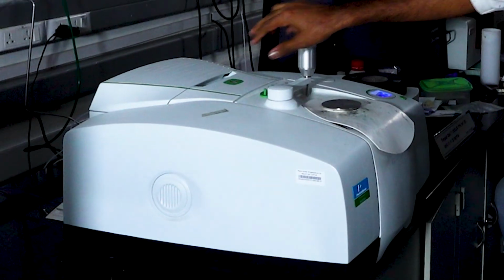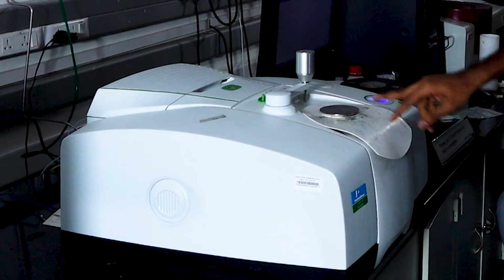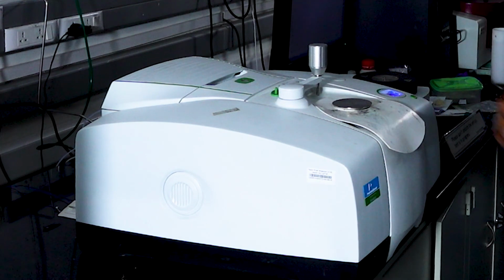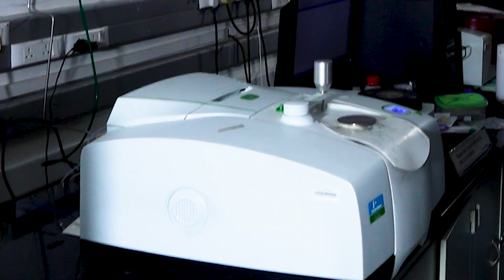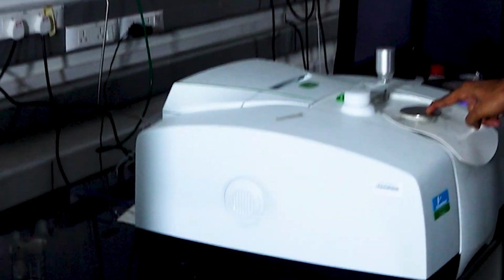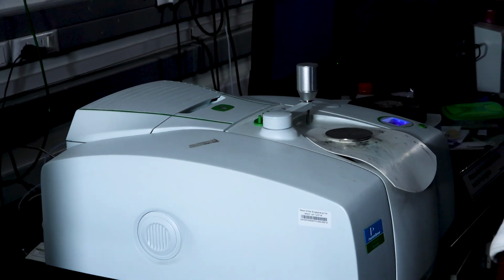Here the light will be coming from this part of the instrument and it will reflect on top of the ATR crystal and go back to the detector. So if you have a liquid sample, we need to place the sample on top of this ATR crystal. As I told, in any mode of FTIR, the first thing you need to take is the background.